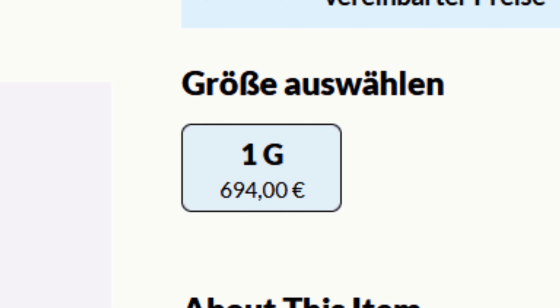This is still very expensive, so maybe we can do more chemistry with it once we actually have it. I think that would be original because as far as I know, everyone on YouTube is only trying to make this compound rather than to use it and make other molecules with it. So I think that's the goal for this video, to have some Cubane and make some other compounds with it.